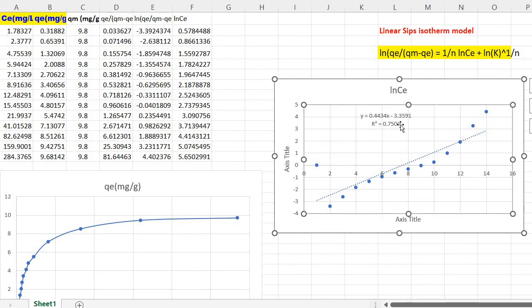Then this equation will appear and R square value will also appear here. So from this equation, we see that slope is 0.443, which is equal to 1 by n, thus you can easily calculate n. And intercept equal to minus 3.359, which is equal to ln K to the power 1 by n. So thus you can easily calculate K values after some manipulation.